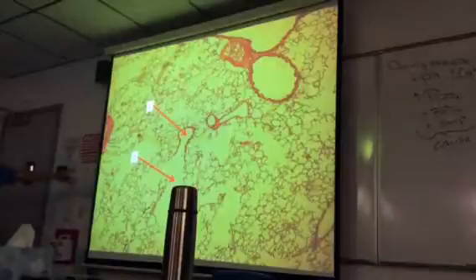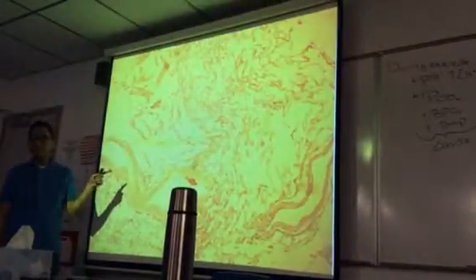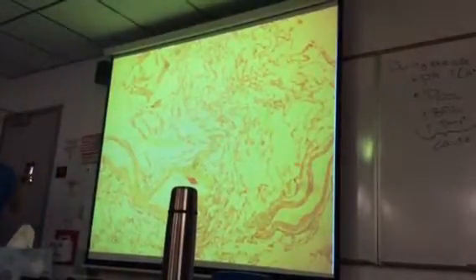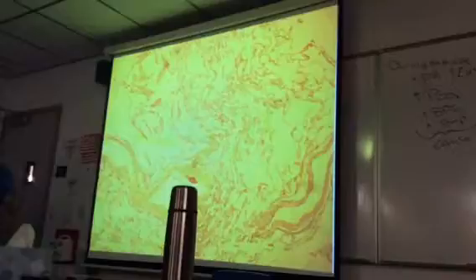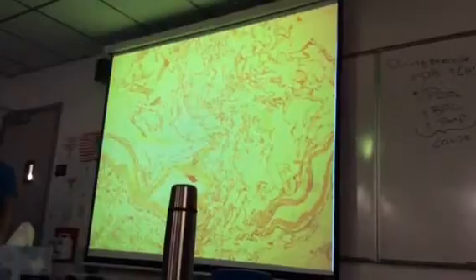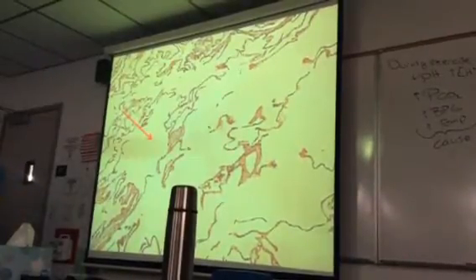Look, this is normal lung. Look at how organized the alveolar spaces are. This is emphysema lung. Do you see a difference? Okay, now if I were to describe the differences, the alveolar structure is broken down. Instead of many small alveoli, which is good, you have fewer alveoli, and the ones you have are larger. And larger isn't better. Larger is more inefficient gas exchange. I'm pointing to one. It hardly even has any structure. I mean, it just looks bad. This is emphysema lung.